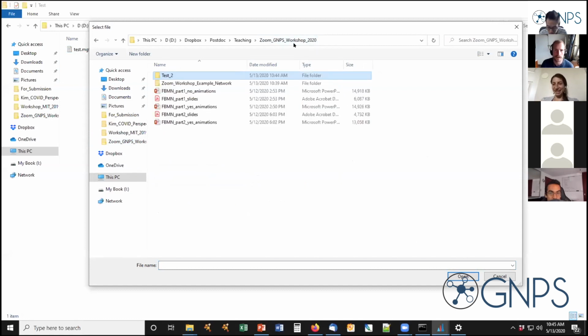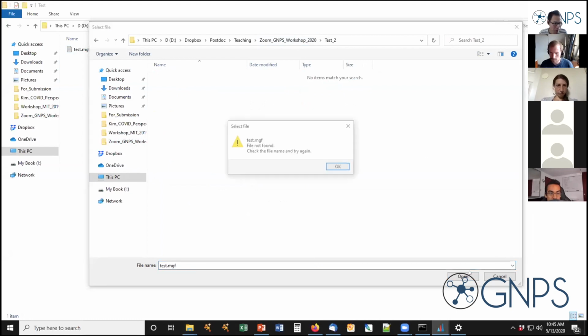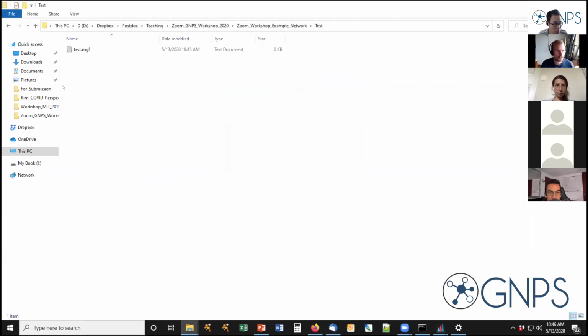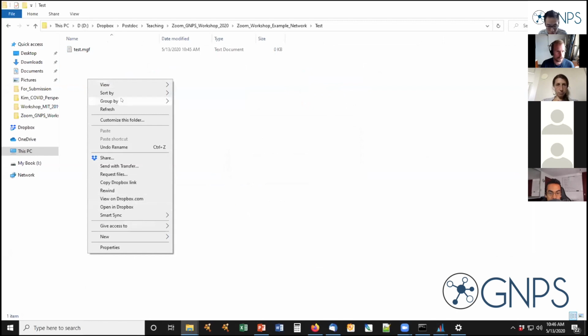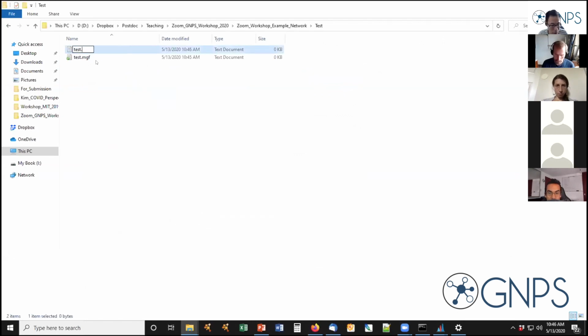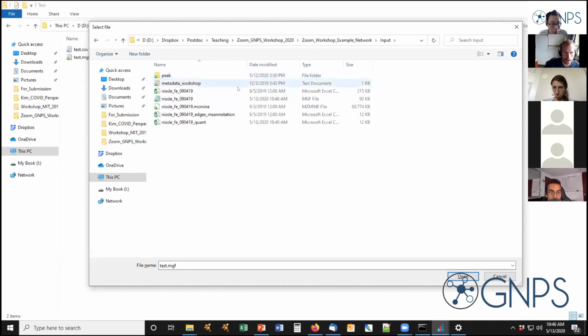Seems it doesn't want to take it. All right, so in that case, I will just overwrite another existing file again.